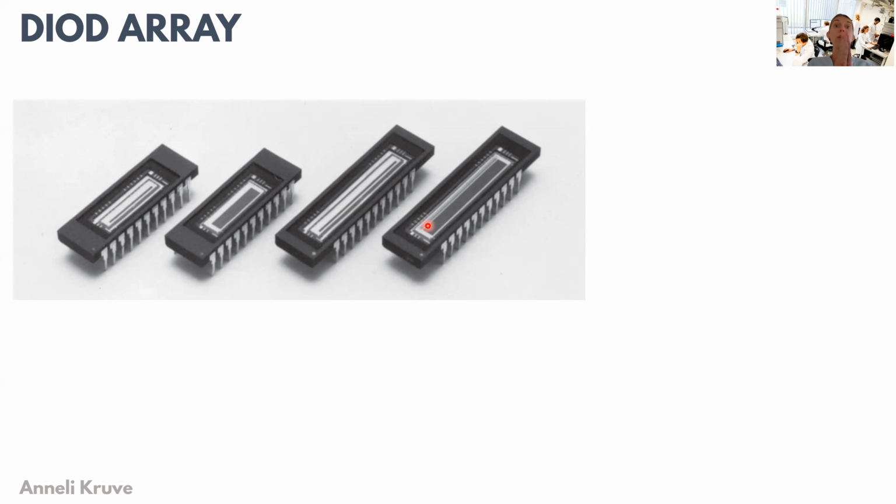So we instantly separate the whole range of wavelengths of interest, and we measure them all at once with the diode array.